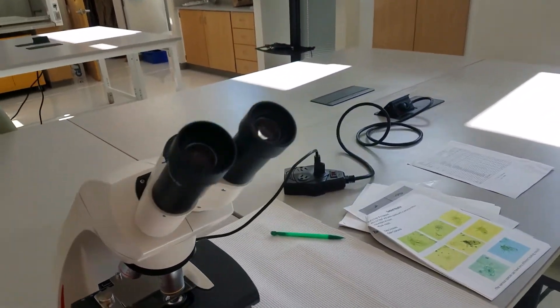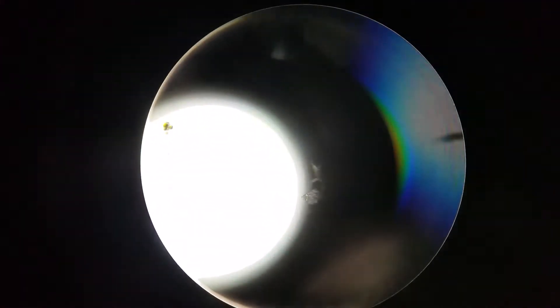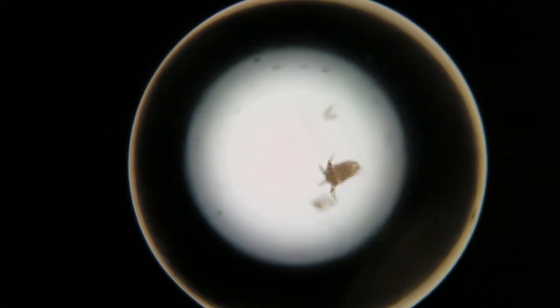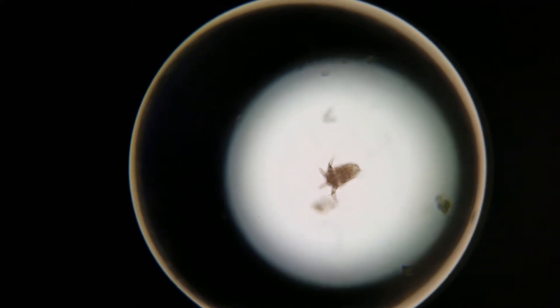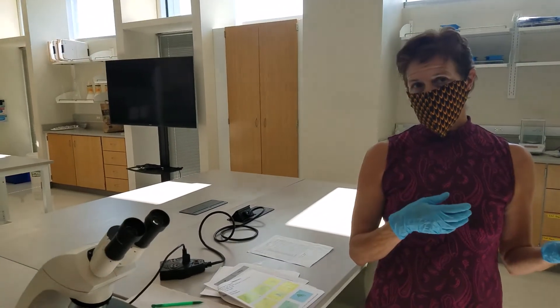We also like showing our good specimens — this is another copepod nauplius, you can maybe see that one a little bit better. I've gone around this slide and I'm not seeing a whole lot of zooplankton on it. I'm seeing a lot of phytoplankton, so I'll probably go back and concentrate the sample.